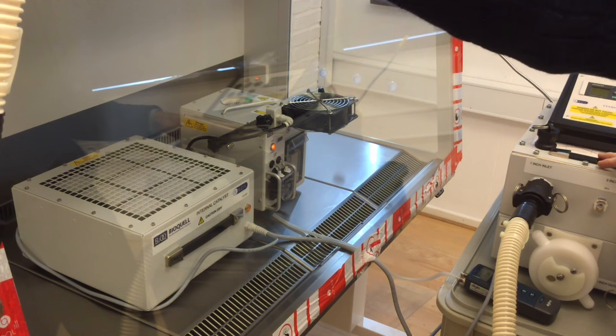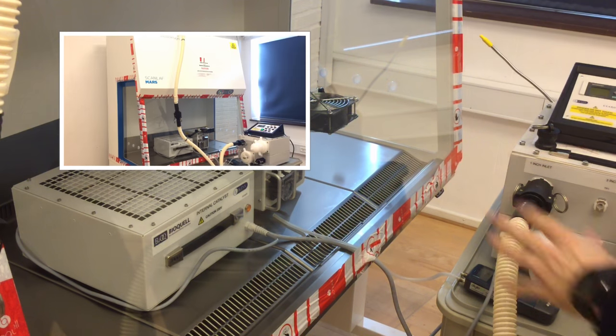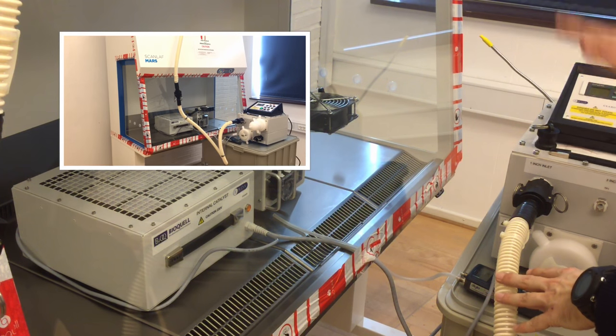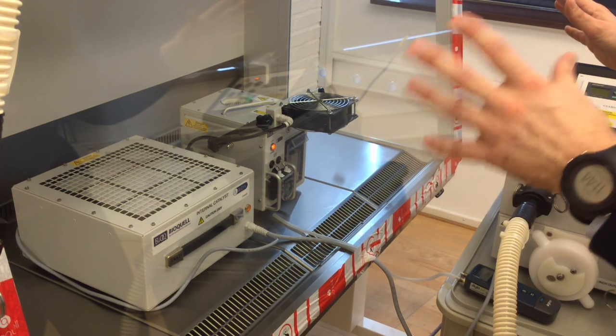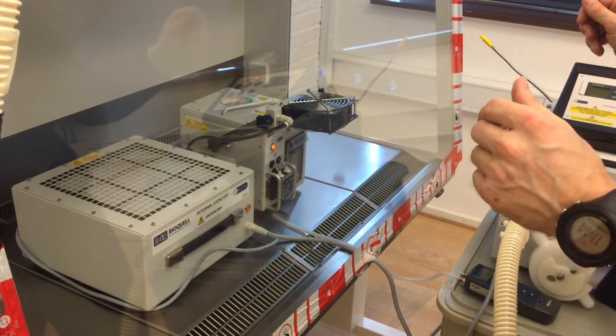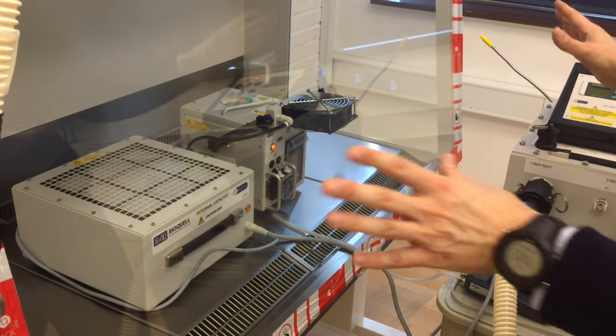And by taking air from the inside of the cabinet to this external catalyst, we are also making sure that we have hydrogen peroxide through the exhaust filter. So the whole of the cabinet is decontaminated.